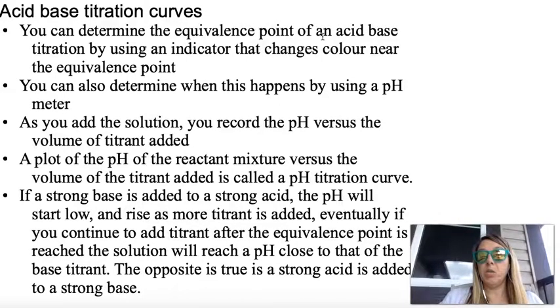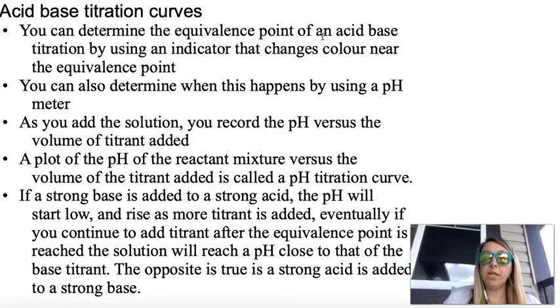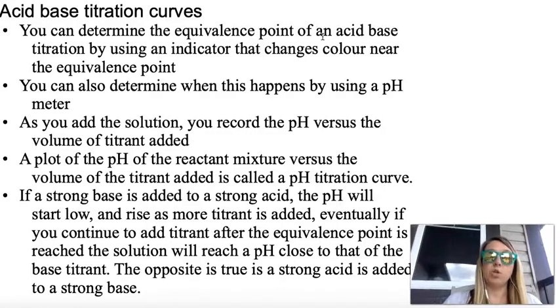So generally when we do that, we're not going to stop when the pH reaches 7, okay? And that's because although in Chem 20 we're always looking for a pH of 7, a lot of times when we do titration curves, that isn't actually what we're looking for. So we're going to continue to add base, either until you reach a volume where we tell you you can stop, or where you see that even though you're adding base, the pH doesn't change anymore. It kind of becomes a constant pH.